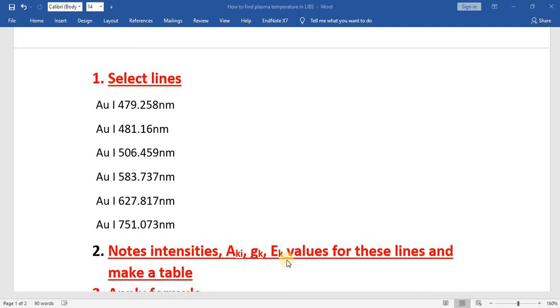The first step is to select the lines. You have to select some lines of a particular element through which you want to find the plasma temperature. I have selected these gold lines: 479, 481, 506, 583, 627, and 721.